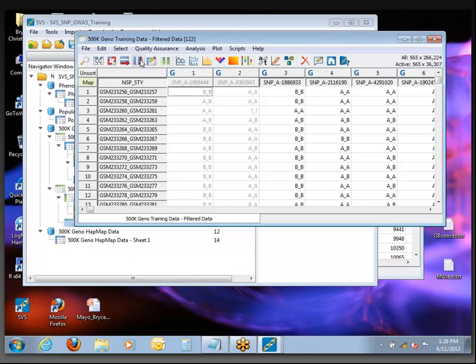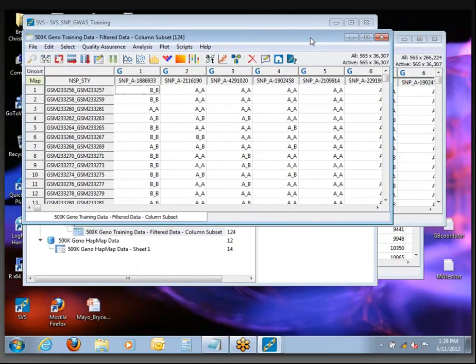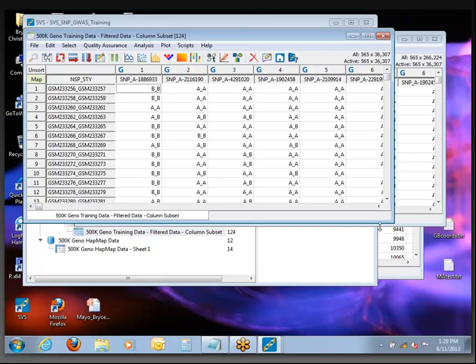Did you get a number somewhere in the neighborhood of 36,000 SNPs left active? There's some statistics and theory that explains this, but I've found that with pretty much any GWAS array — whether it's a 500K or a modern Illumina 5M — if you follow the same basic set of steps and do a 10% LD filter, you always end up with between 30 and 40,000 SNPs left. It's kind of fun how that always works out.